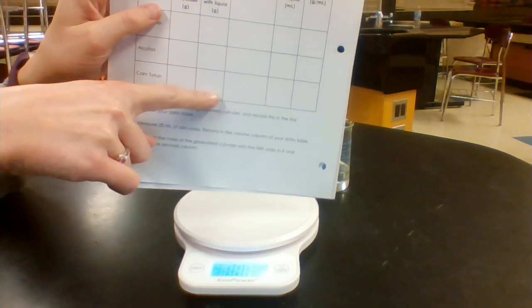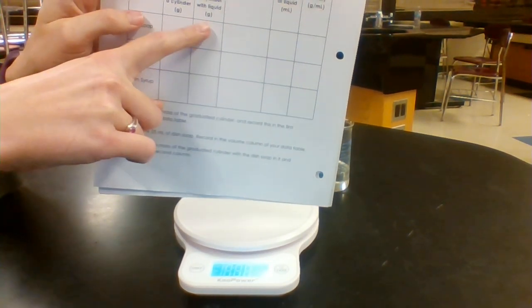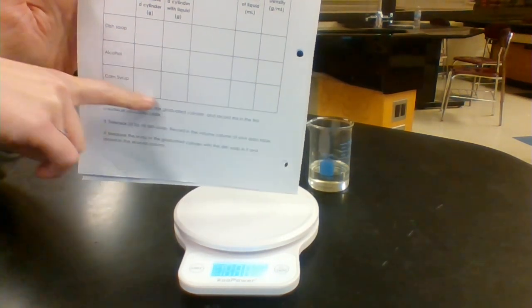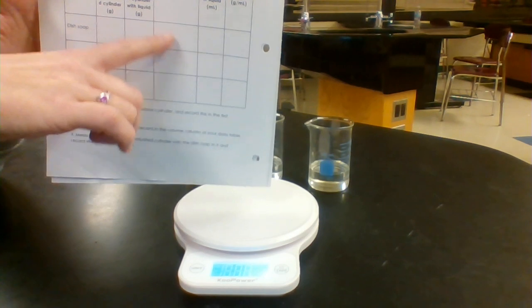So in that second column, you need to write all of that data down that we just got. So tell me what the mass was for the dish soap, the rubbing alcohol, and the corn syrup. Once we have this whole table filled out, we then need to find just the mass of the liquid itself.